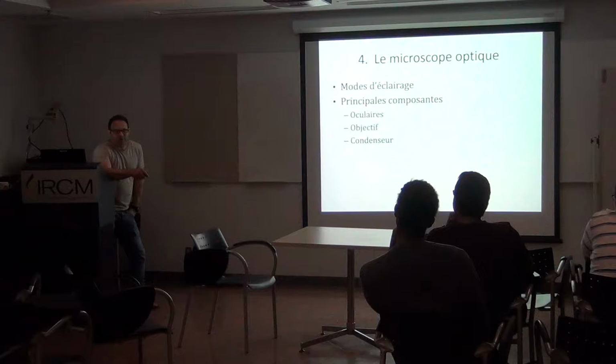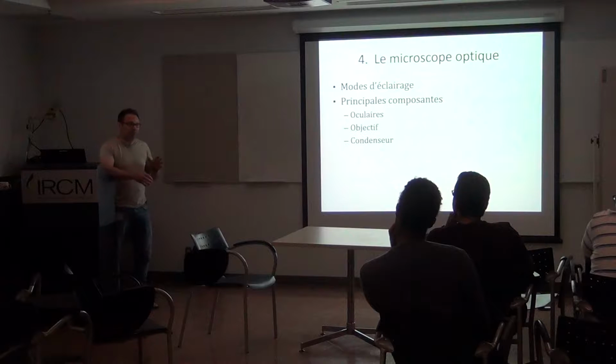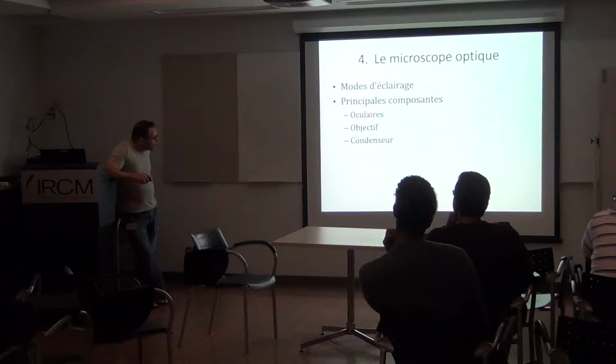But the computer screen will not be as detailed as the ocular, because you get the screen and the pixels, and there's also a transfer of the real data into an image. So there is a camera system between those things. So the ocular is still a nice thing to add into a microscope.